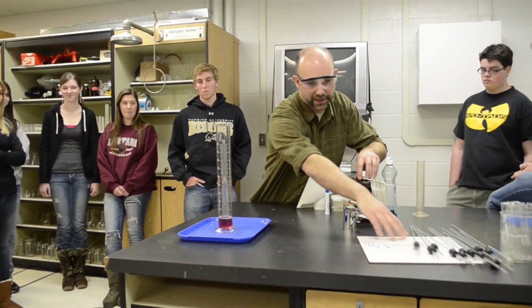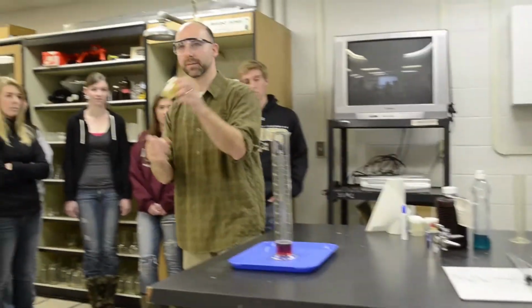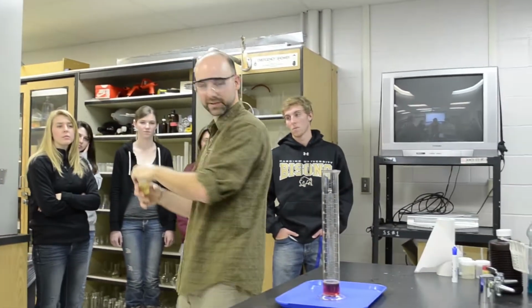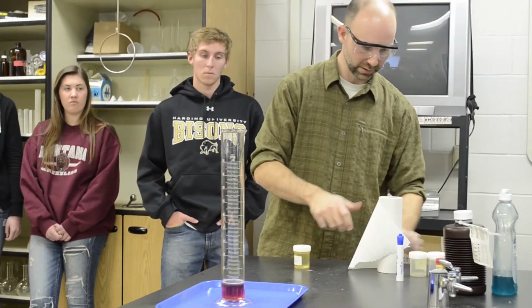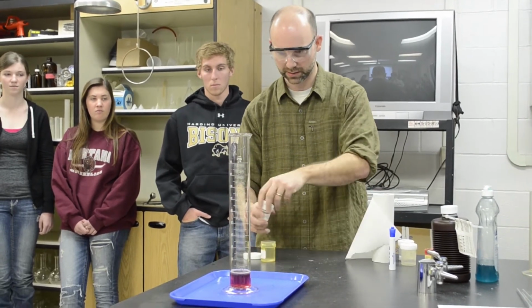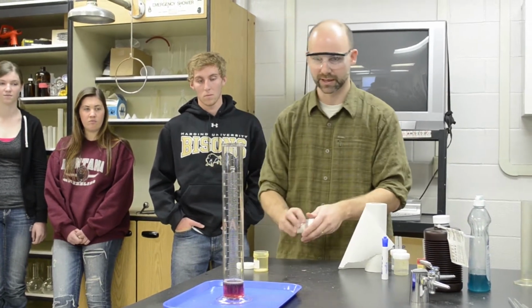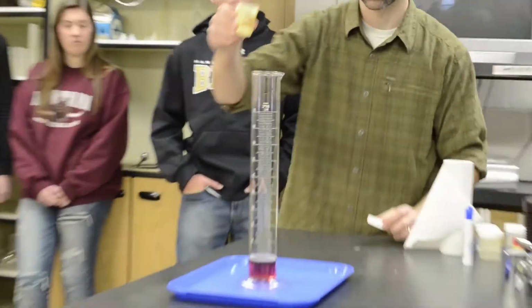Move some stuff out of the way. Here's my catalyst. It's called sodium iodide. Notice how it has a brown color to it? It's just a solid little crystal. So I'm going to dump some of this in there. I should probably get a little bit more. More catalyst can't be bad. Well, I say that because you have about 25, 30 more milliliters than I should have of hydrogen peroxide. So here we go. Catalyst.